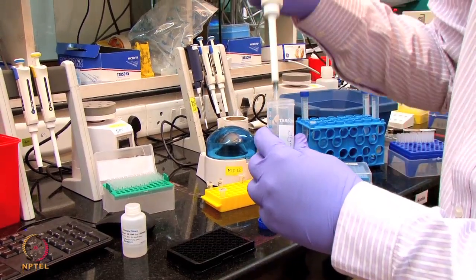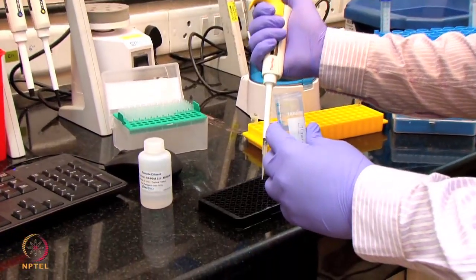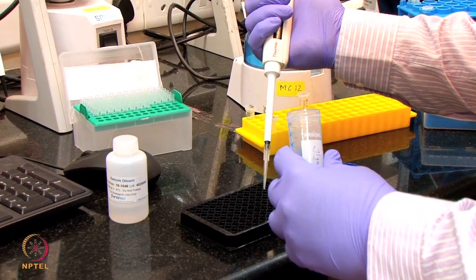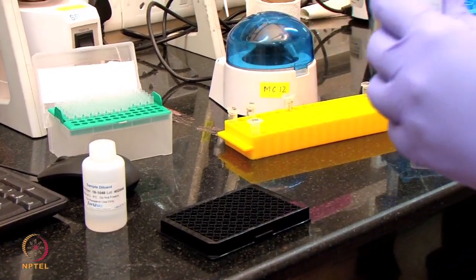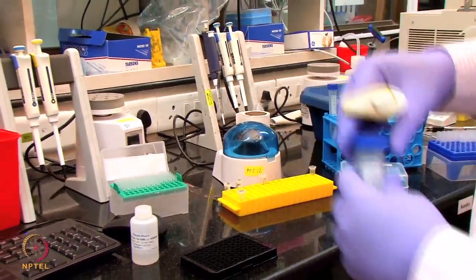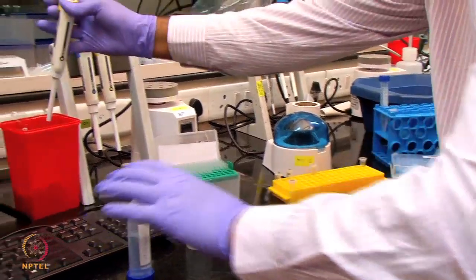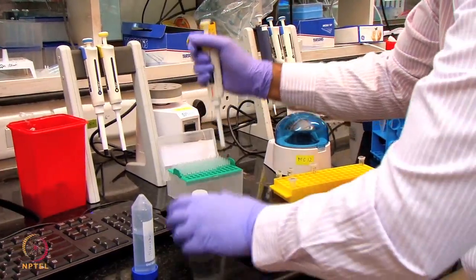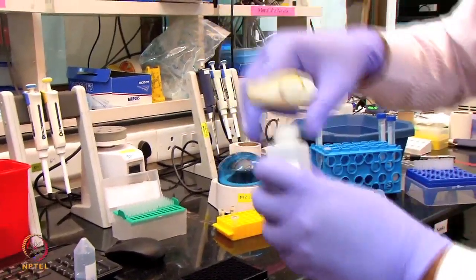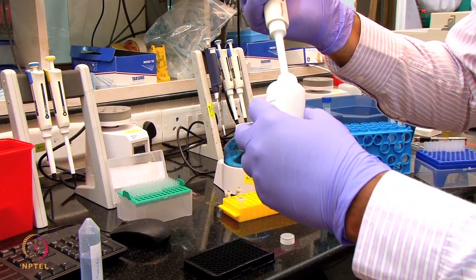The regeneration buffer, I'm going to place at A11 and B11. The bound apolipoprotein will be washed off when the sensor dips into this acidic buffer. We also have to place one more, which we call the neutral buffer, that is the PBST buffer. I'm going to place this one at A12 and B12.